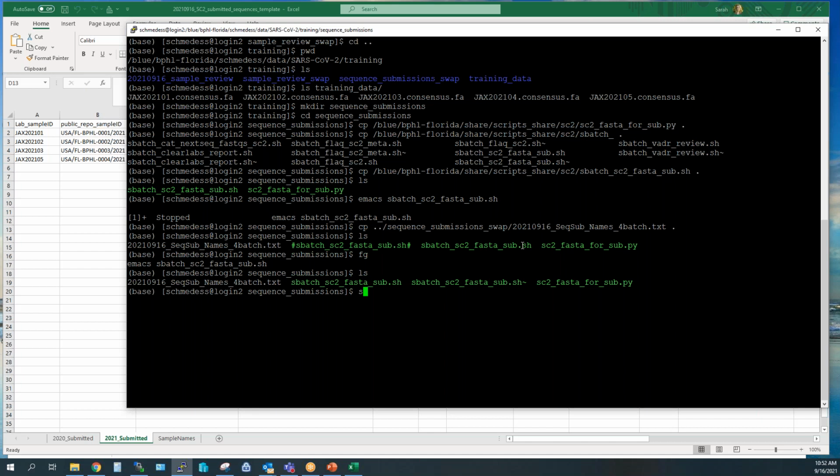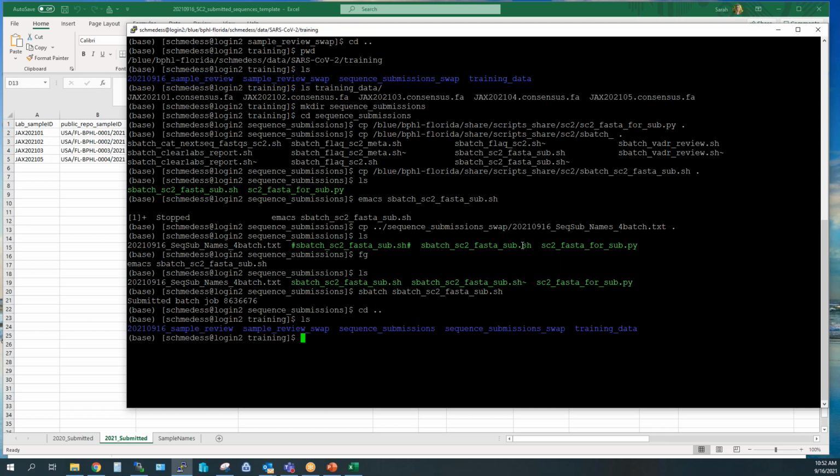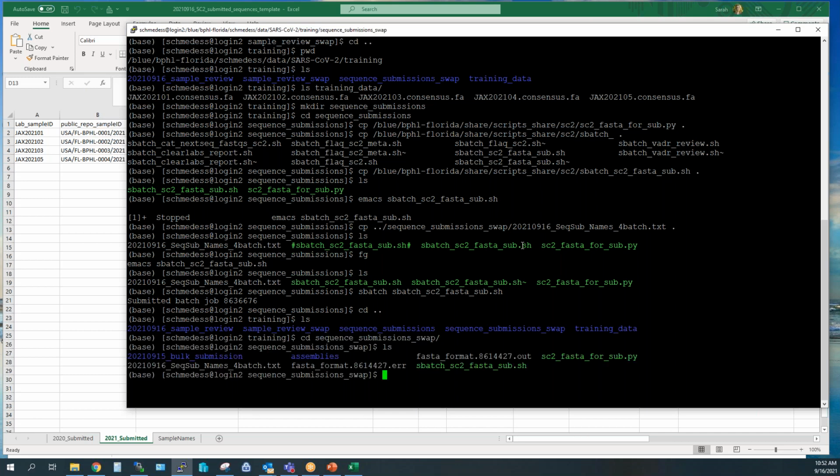And then we can execute this, just like that. So that's going to run, and then go back to the one I ran last night, so I can just go over what it looks like when it's finished. I had my inputs in a separate folder here in assemblies, but you're going to see your scripts from your input folder, if you have copied it in there, our name file.